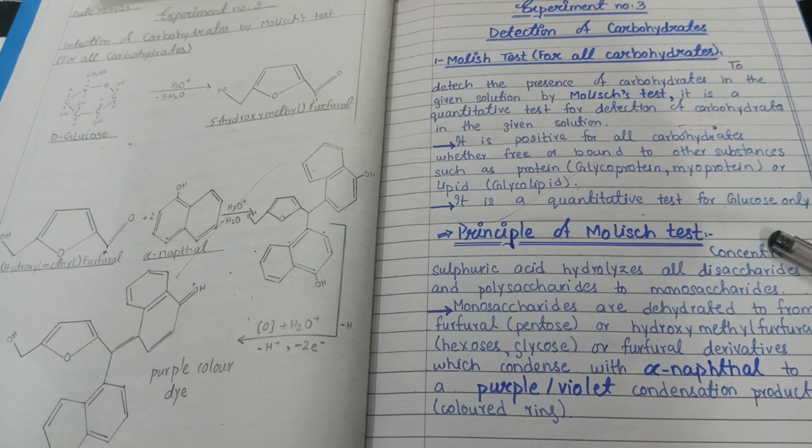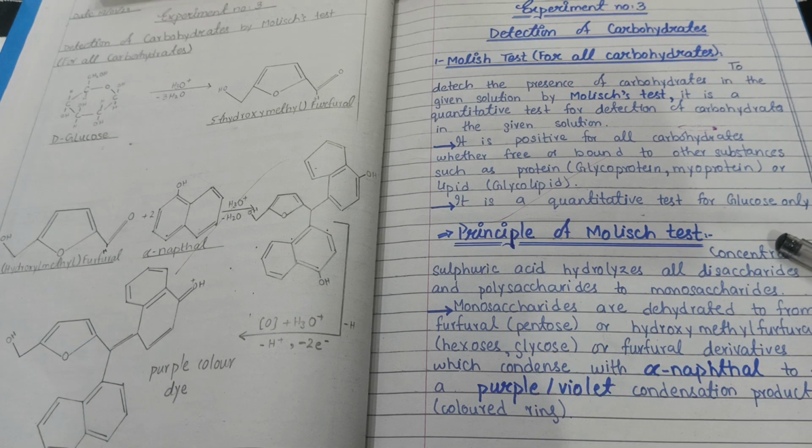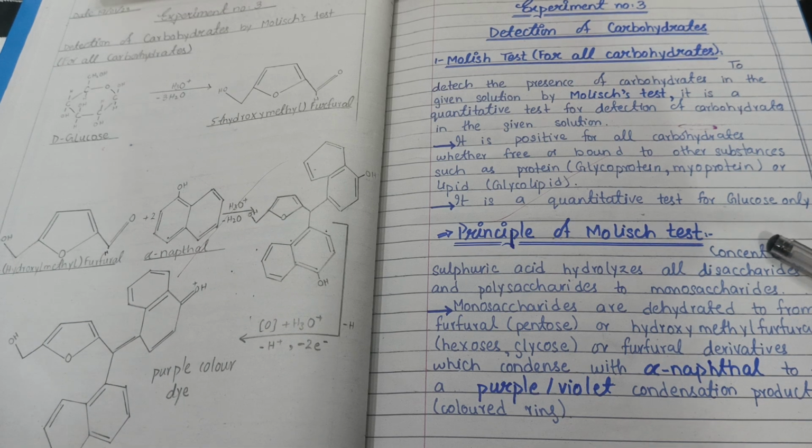So this will be part one, and in this part we will discuss all the experiments related to carbohydrate detection. For example, if you are given a solution that contains some carbohydrates, and another solution which has no sugar in it, how will you differentiate them? By these tests you can differentiate them.